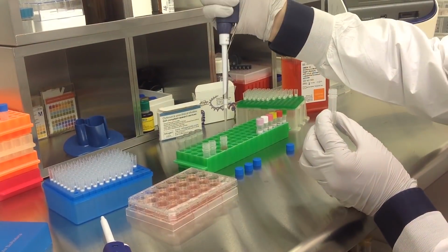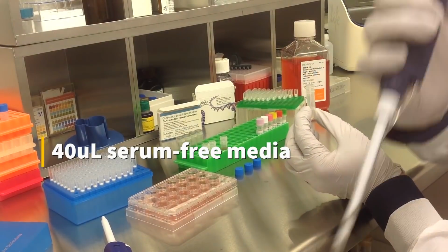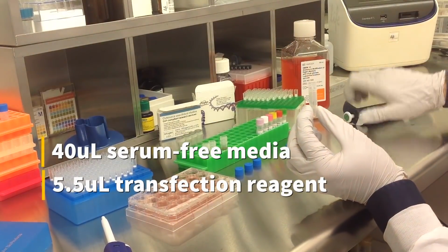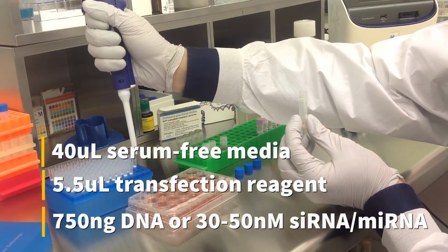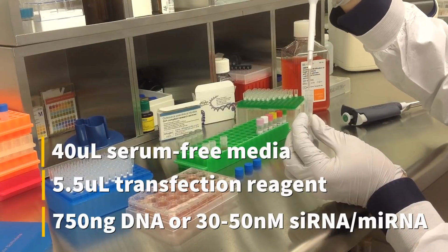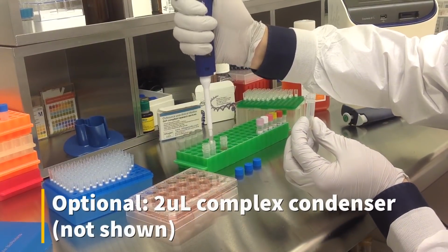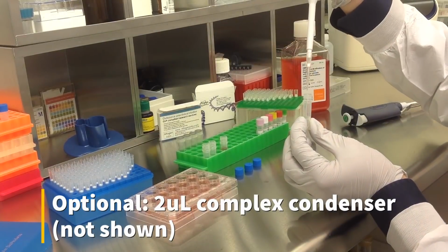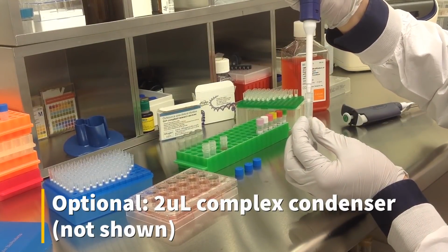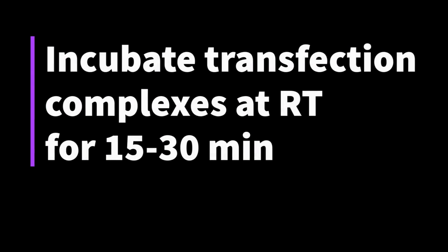To prepare transfection complex, mix 40 microliters of serum-free medium, 5.5 microliters of transfection reagent, and either 750 nanogram of DNA or 30 to 50 nanomolar siRNA or microRNA. An optional step is to add 2 microliters of complex condenser, which increases transfection efficiency, but may also increase cytotoxicity. Incubate the prepared transfection complexes at room temperature for 15 to 30 minutes.